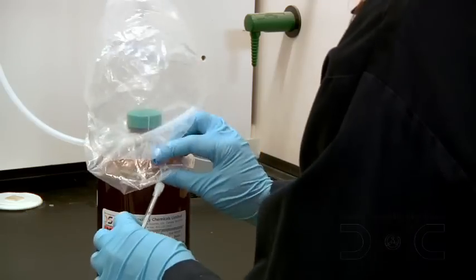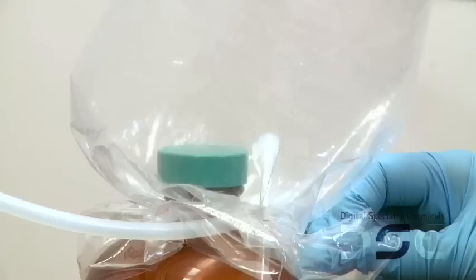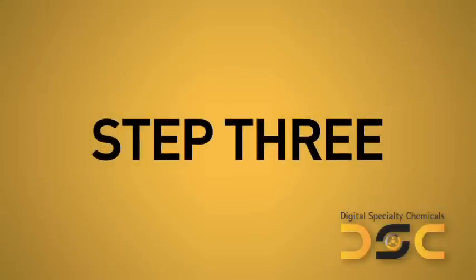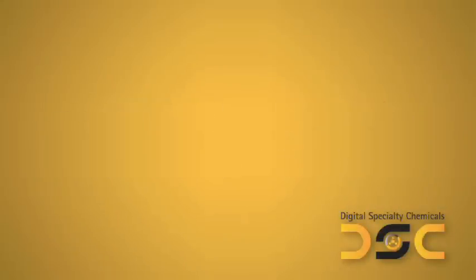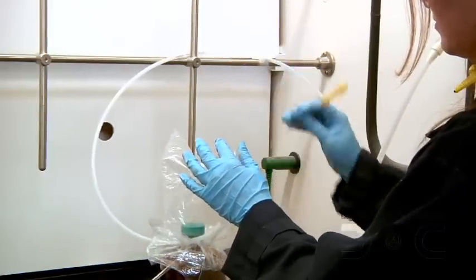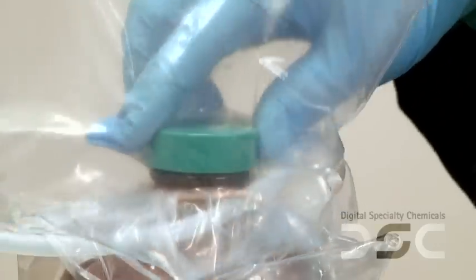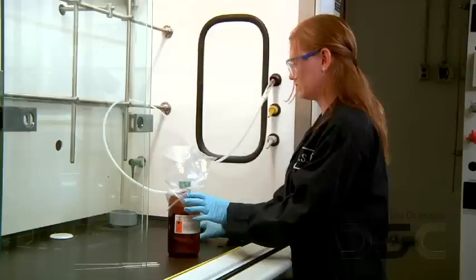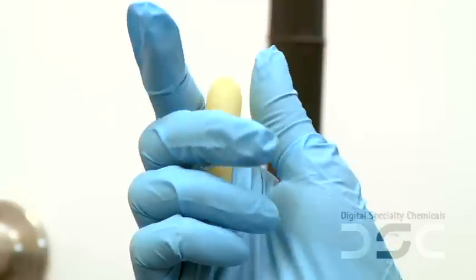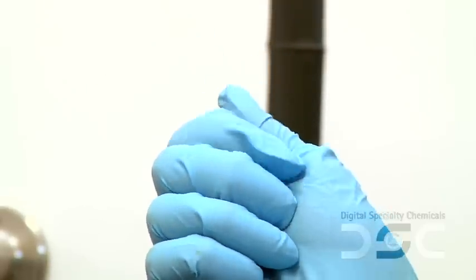Lastly, place the purged sample vial or tube inside the nitrogen-filled bag. Using a sharp object, puncture a small hole in the plastic bag. Loosen the bottle lid under the stream of nitrogen. Then insert the pipette tip into the plastic bag and purge the pipette three to four times with nitrogen.